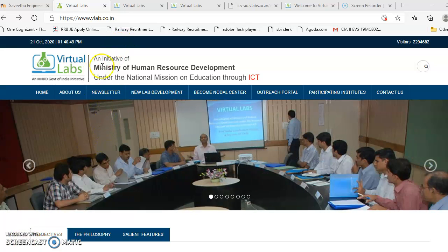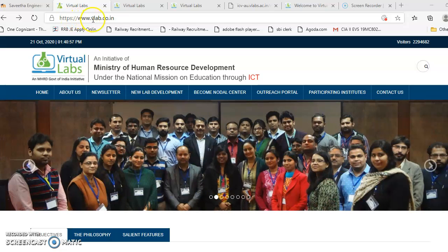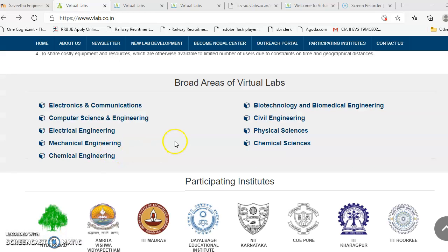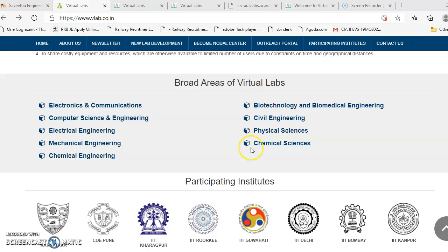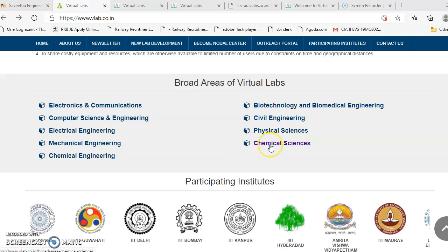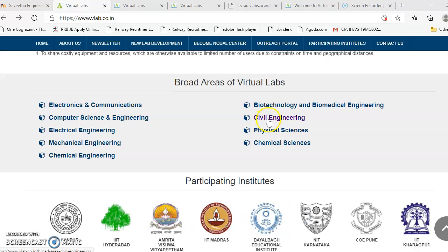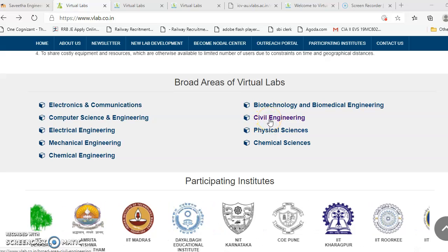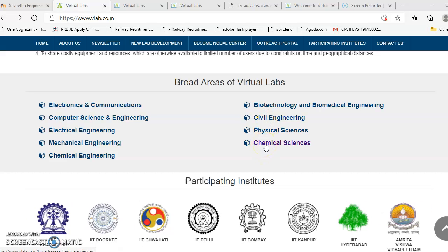Hi students, today let me demonstrate how to do a virtual lab. First of all, you get into the website www.vlab.co.in, where you can see at the bottom there are many broad areas of virtual labs. You can get into either chemical science or civil engineering, because some of the experiments are available even in civil engineering.